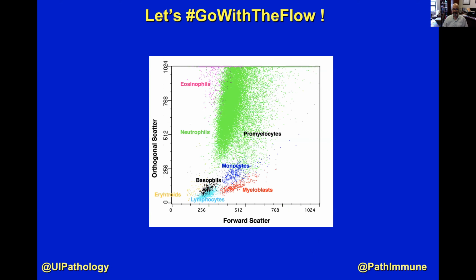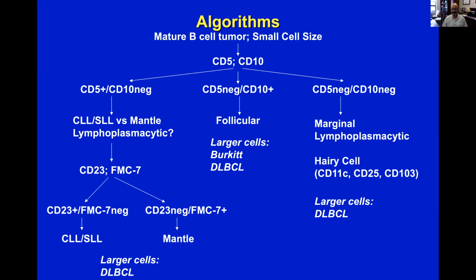So with that kind of case introduction, let's go to the actual software and see how this works live. Just a reminder of where populations will fall. And this algorithm is what we would use in a couple of the cases. So if you want, you can pause and revise this. I went over this in a previous video. And then we will now switch over.